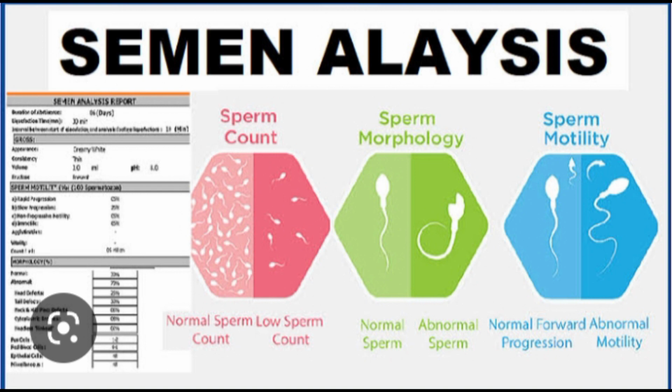Two parts concentrated alcohol solution of eosin, 1 part alcohol 95%, 1 part. Wash with water and counterstain with Loeffler's methylene blue for 30 to 40 seconds. Wash, dry and examine under oil immersion. The heads of spermatozoa are stained purple while the tail and middle piece take red or pink color depending on the duration of staining.